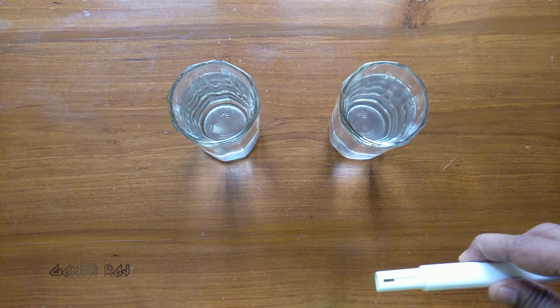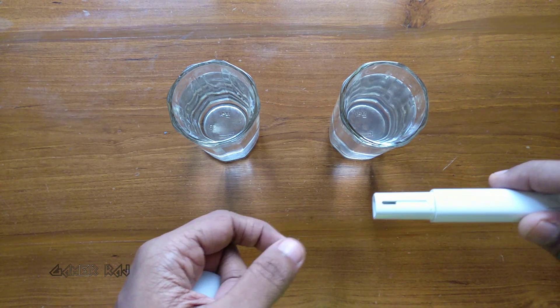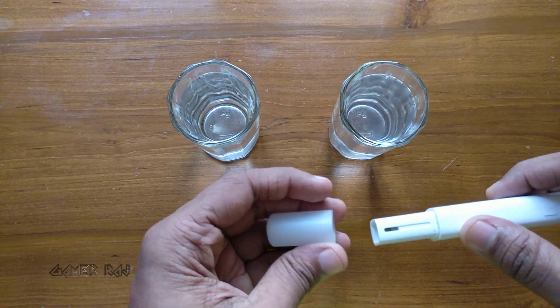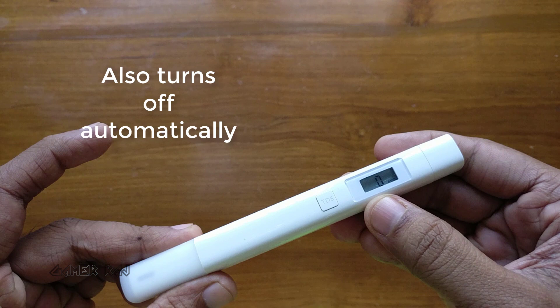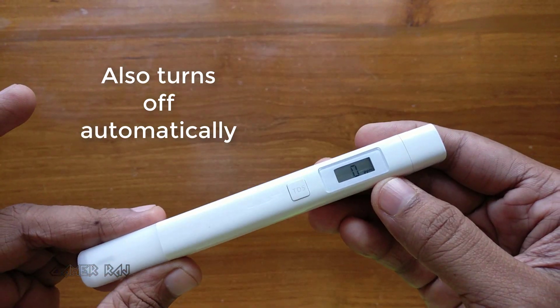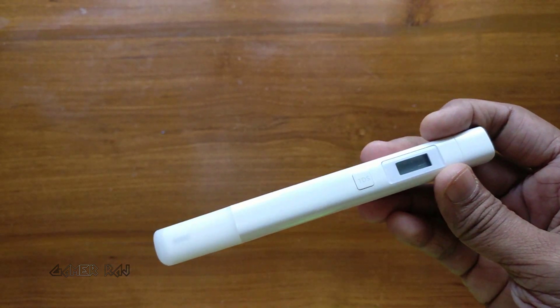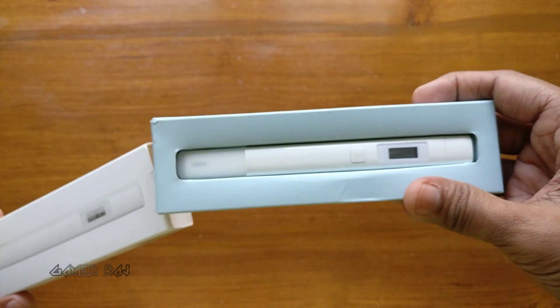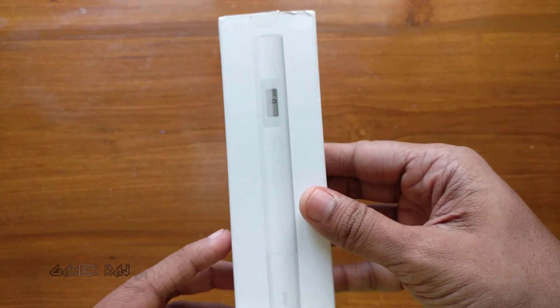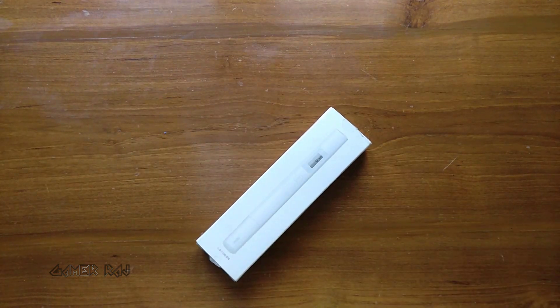After using, shake off the water and wipe with some soft cloth. Close the cap. I carry this water tester whenever I am away from home and it is really useful. If you are interested, you can find the product link in the video description. Hope the video was useful. Peace.